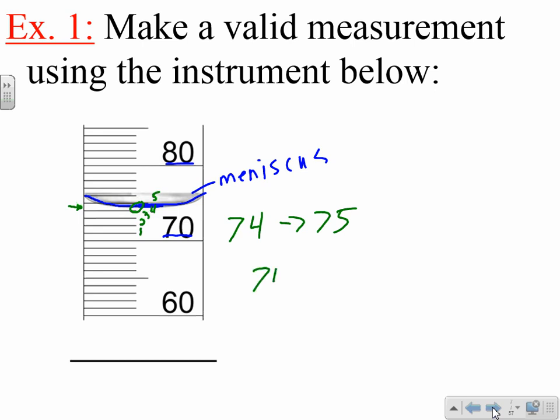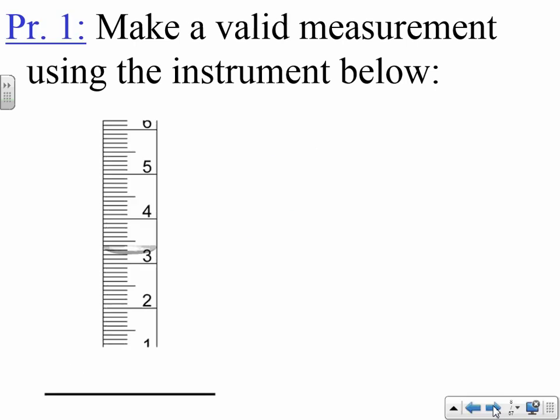Now we're between 74 and 75. And it looks like we're halfway between there. This looks to me like halfway, which means between 74 and 75, we'll have to estimate somewhere right halfway through it, which would give us 74.5. That's halfway through it. In this case, the units will be milliliters because a graduated cylinder measures in milliliters. And this is your final answer. So what you get is you get one decimal place past the point. Hopefully that makes sense. I want you to go ahead and practice this on your own and do the same exact thing.